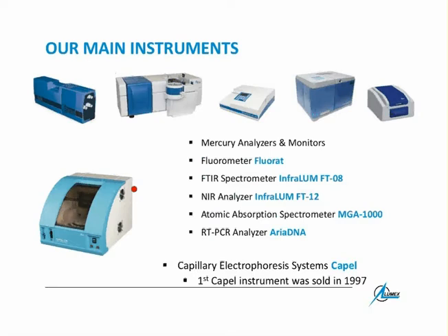Okay, let me now address another question which very often pops up when we talk about capillary electrophoresis. You know that we announced two topics for today's discussion: capillary electrophoresis with streaming potential control to increase the reproducibility, and capillary electrophoresis for the analysis of proteins, any kind of proteins.